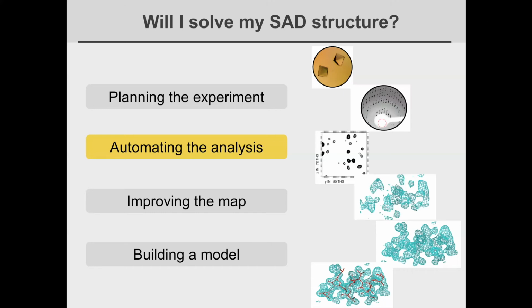Let's see, I saw some questions fly by, but I missed them. So yeah, Tom, there have been some questions. I want to summarize one or two of them. They're talking about low FOM. So if it's less than 0.2, should I stop, or can I do it with a low figure of merit? Yeah, so that's a really great question.